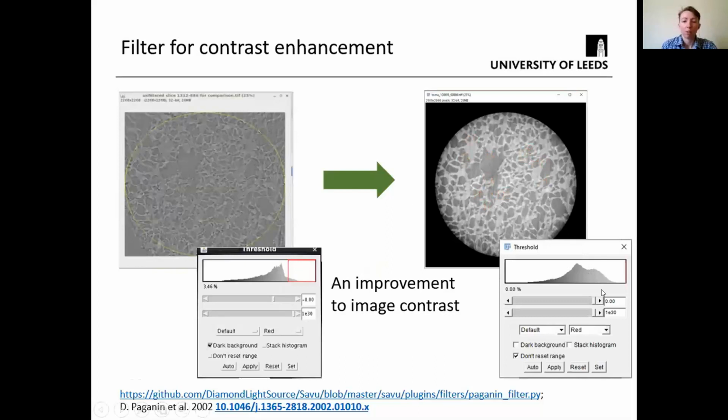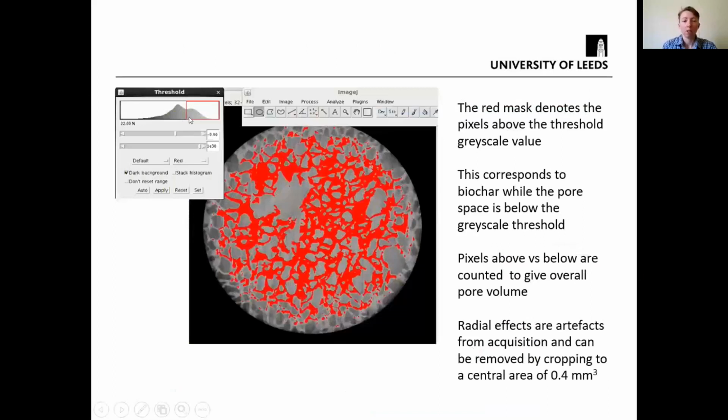And if you look at the histogram, there are not two fully resolved peaks, unfortunately, but the resolution between the two is much greater. And you can see that there are two peaks present here on the histogram grayscale. Then it's a trivial matter to set the threshold value in between the two, as you can see.